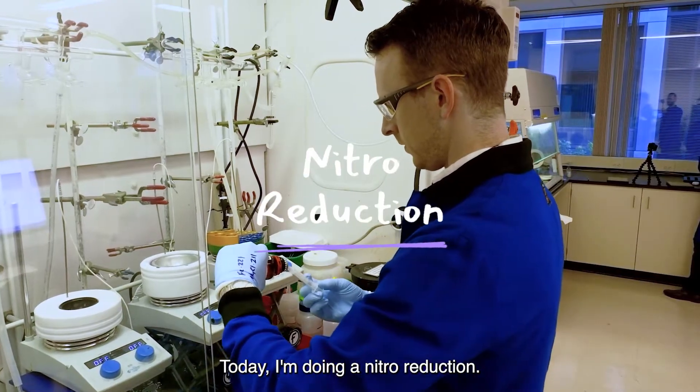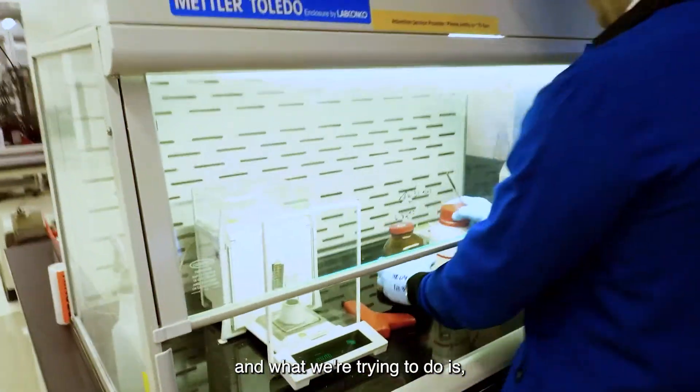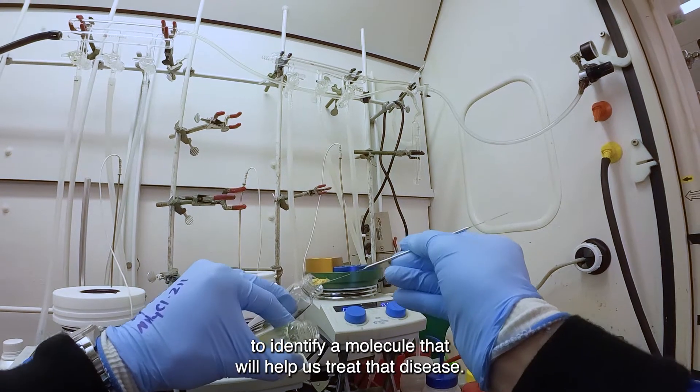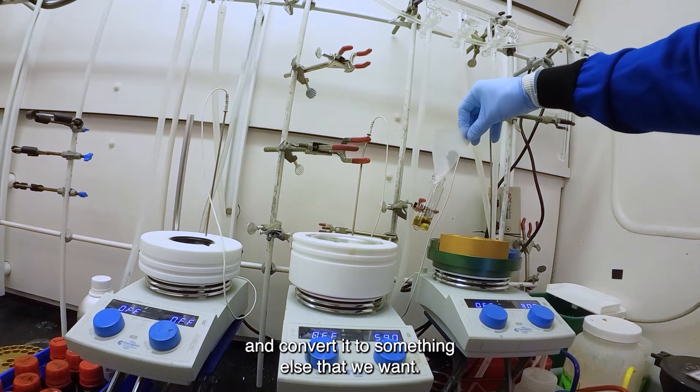Today, I'm doing a nitro reduction. We've identified a disease that we want to try and target, and what we're trying to do is identify a molecule that will help us treat that disease. We'll add reagents that will react with the starting material and convert it to something else that we want.